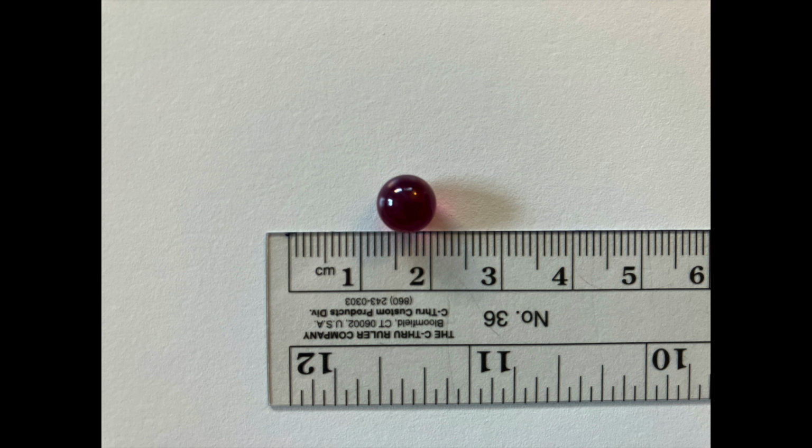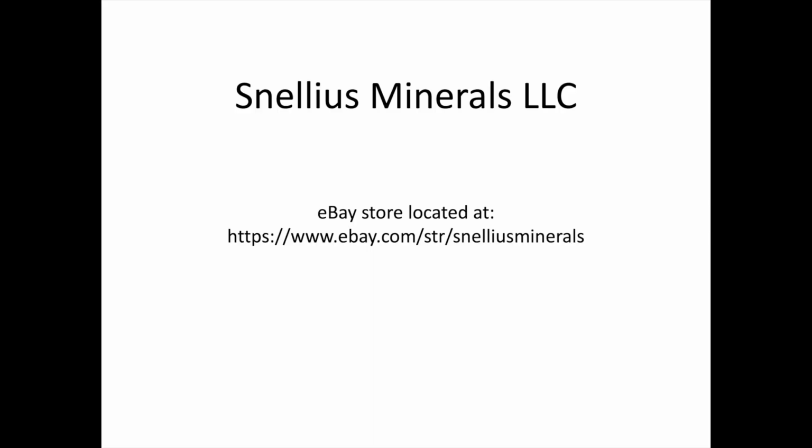And the star ruby that we're examining today is indeed synthetic. If it weren't and were natural, it would be very, very expensive. But that isn't the case here, and you can pick up your own synthetic corundum sphere with asterism from the eBay store Snellius Minerals if you'd like to follow along with our experiments today. You'll also want some form of polariscope and also a normal everyday flashlight.